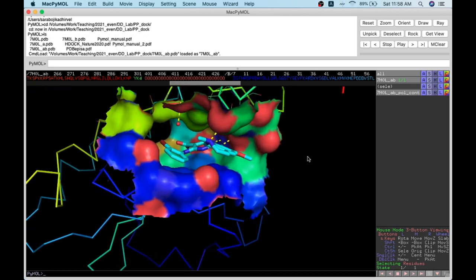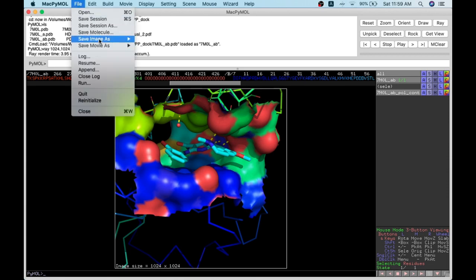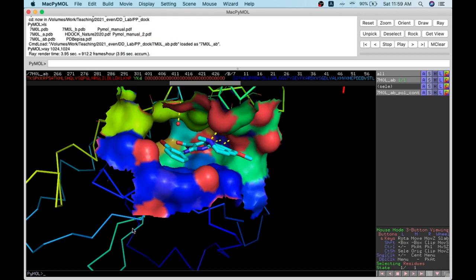Talking about rendering — you can give the ray command either through the top toolbar or the command line. Using a white background makes it easier to follow. After giving the ray command with size, for example 'ray 1024, 1024,' the rendering gives a high-resolution image with clear pixels. You can save this in PNG format using the 'save image' option — do not take screenshots in PyMOL. Use 'save as image' so that the image is stored in a specific folder for future use.